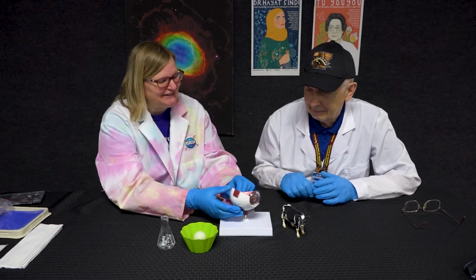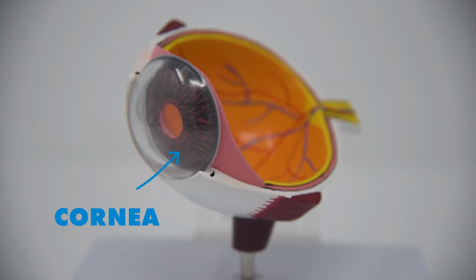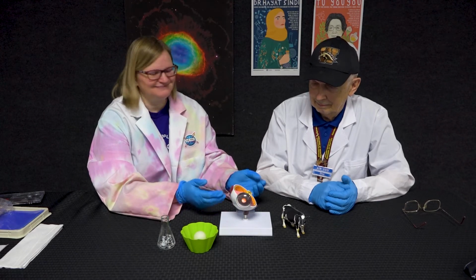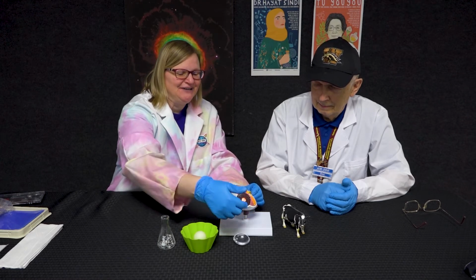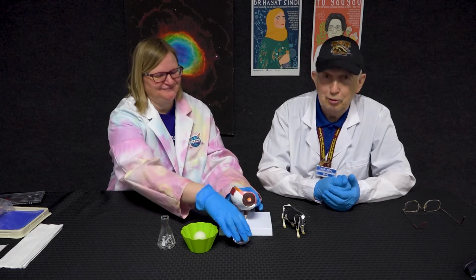So on the outside of the eyeball, covering that extra hole that maybe you didn't even know about, is the cornea. It's kind of like this protective cup. It keeps your eyeball from getting too bunged up, and also sometimes it needs extra repair. And so the light travels through it and into the hole in your eye. Now, the cornea can also be used for helping to focus the light as it comes in.